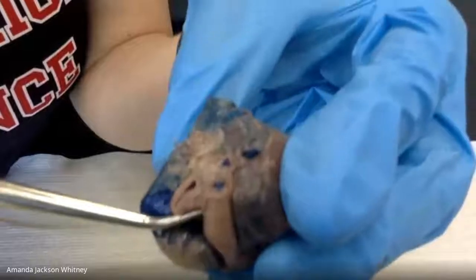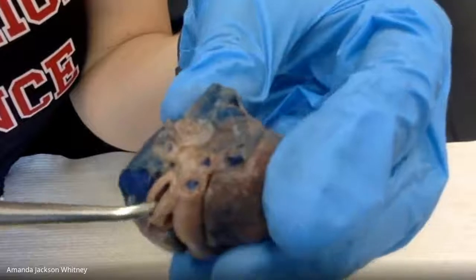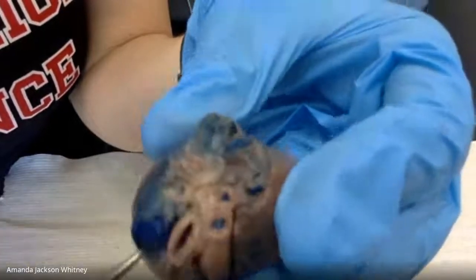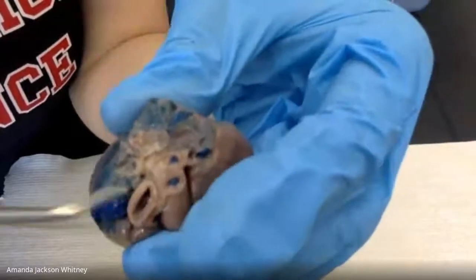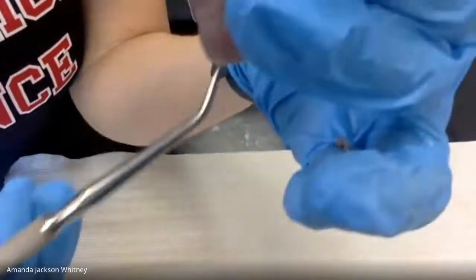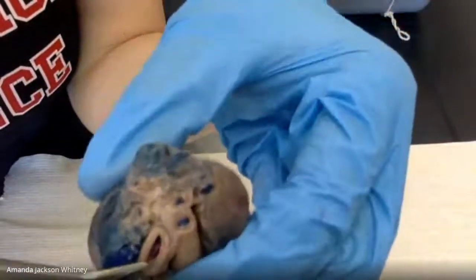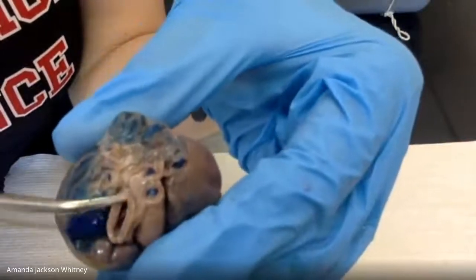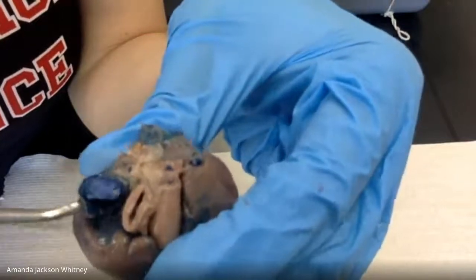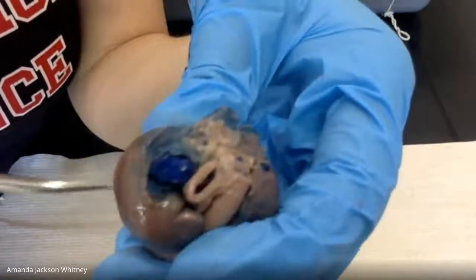It is oxygenated at this point, but it needs to be able to not break under any other guesses? It needs to be able to withstand all the pressure. Yes, exactly. So there's a ton of pressure when blood is being forced out of the left ventricle and up and out of the aorta. There's a ton of pressure in that blood that's exerting on the walls of the blood vessels. And so the aorta needs to be much thicker than this, which is the superior vena cava, bringing blood down into the right atrium.